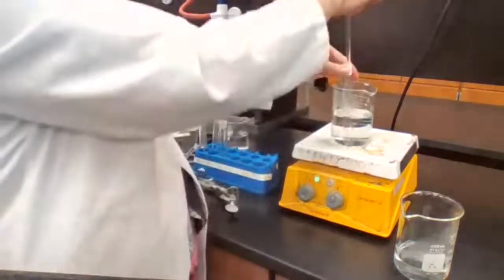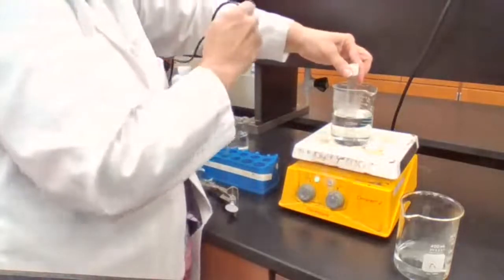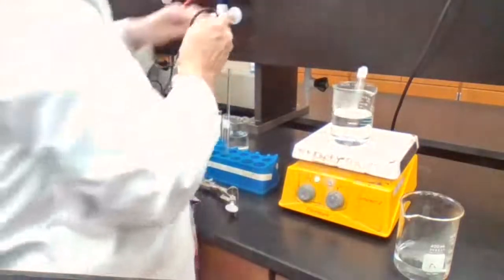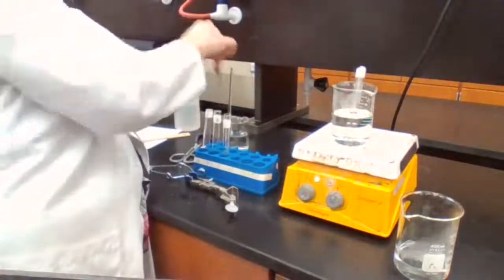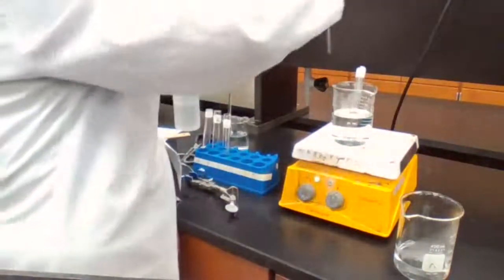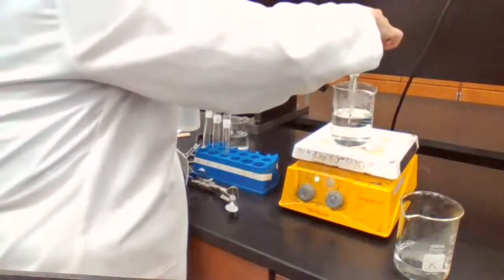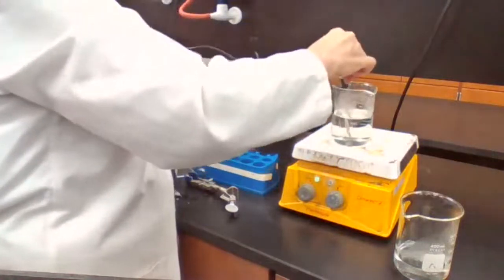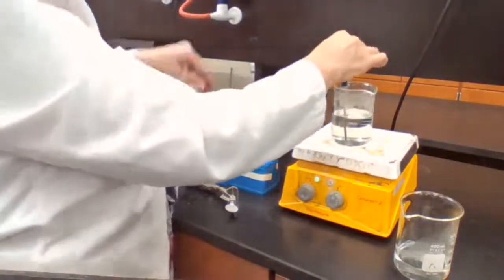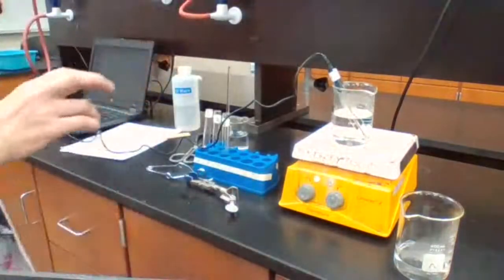So it's clear while it's inside. I'm going to place the thermometer to measure the temperature while it's in the solution. I'm going to let it go up.